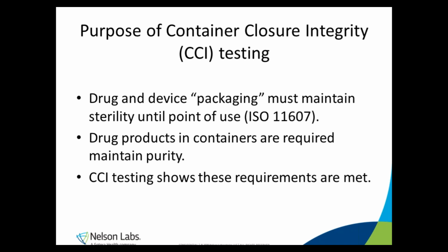There's also a requirement that drug products maintain their purity. Some drug products are sensitive to air, and air molecules being smaller than microbes, in order to ensure that no air can enter the container, we need a test with a really small defect size. Bubble emission test can detect about a 250 micron leak. Dye migration test is a little more sensitive, about a 50 micron leak size. But most of the CCI tests are capable of detecting leaks that are 10 microns or smaller. So a CCI test would show that both these requirements, sterility and purity, are met.